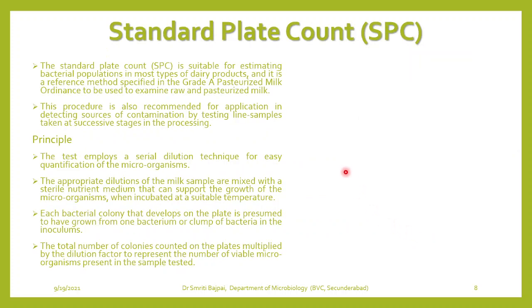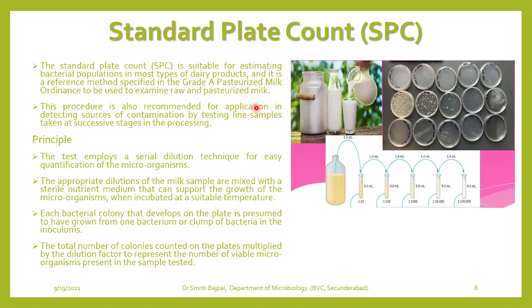So now we will go to the second method, that is the standard plate count. The standard plate count method, again, is for the estimation of the bacterial population.